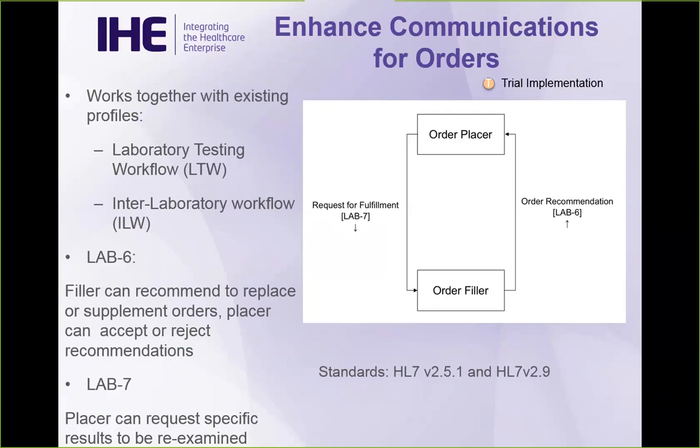Here's a replacement order. What do you think about it? And then it gives the clinician the option to say, yeah, go ahead, I accept your recommendation, or no, I don't want your recommendation. Or if they don't respond, it handles that situation as well.